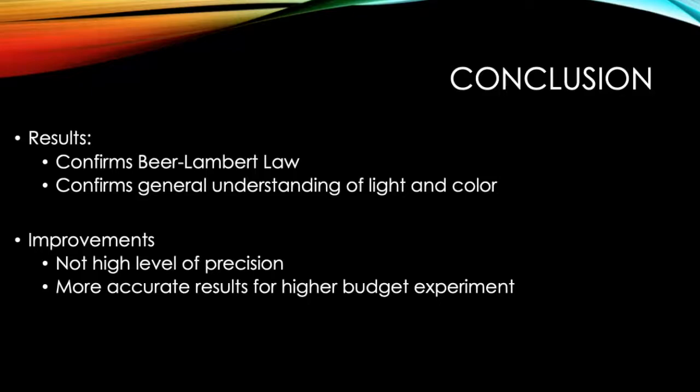It is certainly possible to improve on this experiment's design. With a higher cost of production, there would be a higher level of accuracy. Regardless, this experiment still serves as strong proof of Beer's law in spectroscopic techniques.